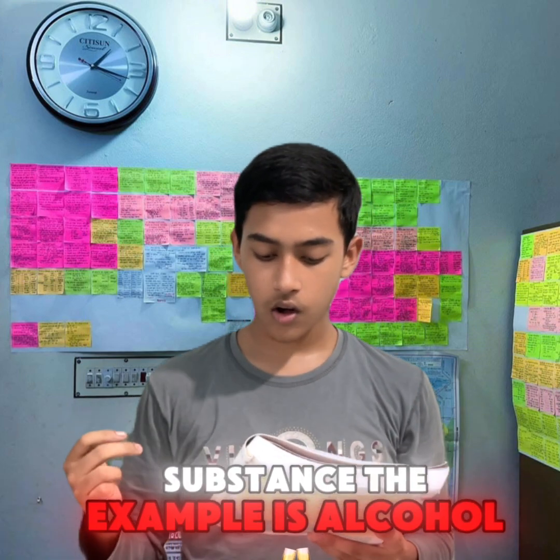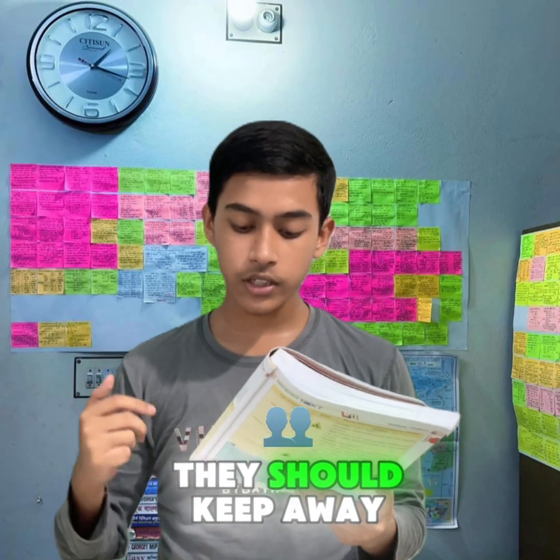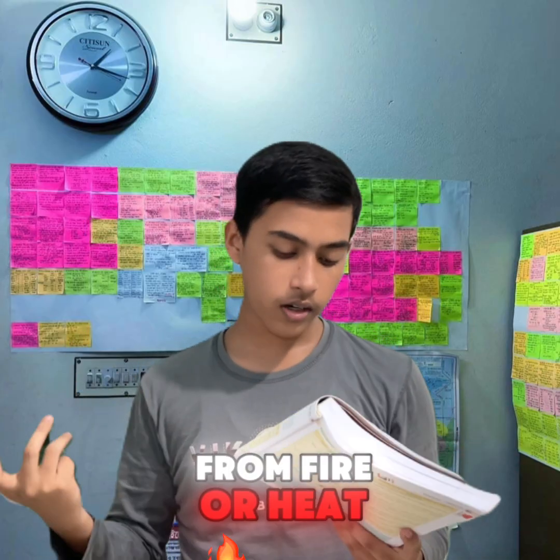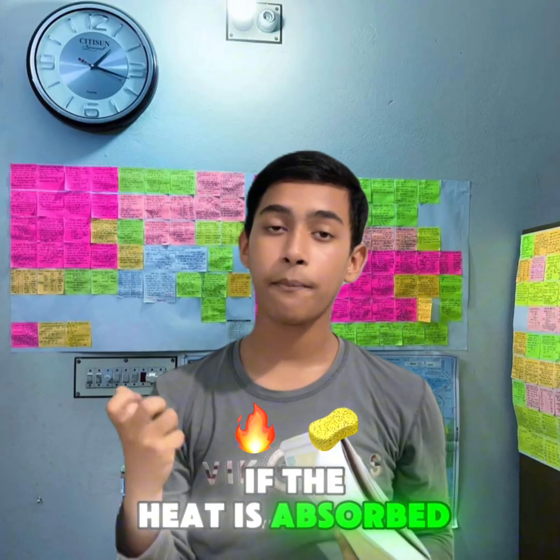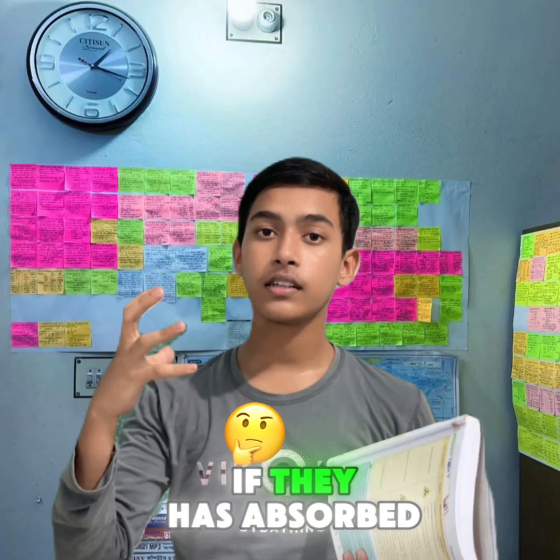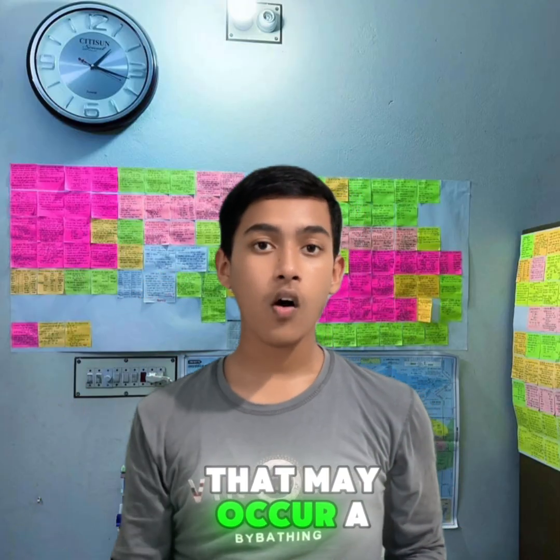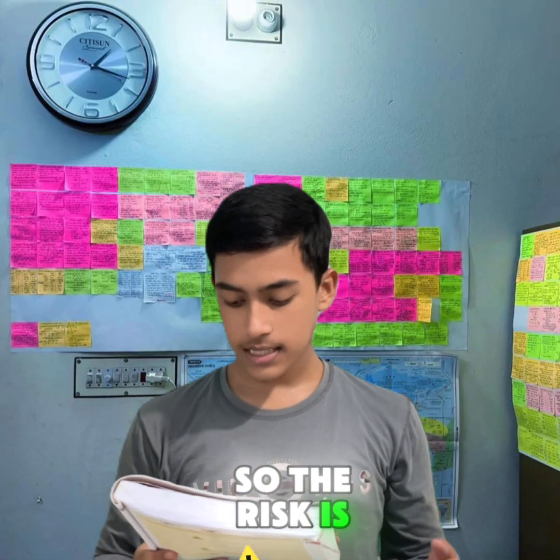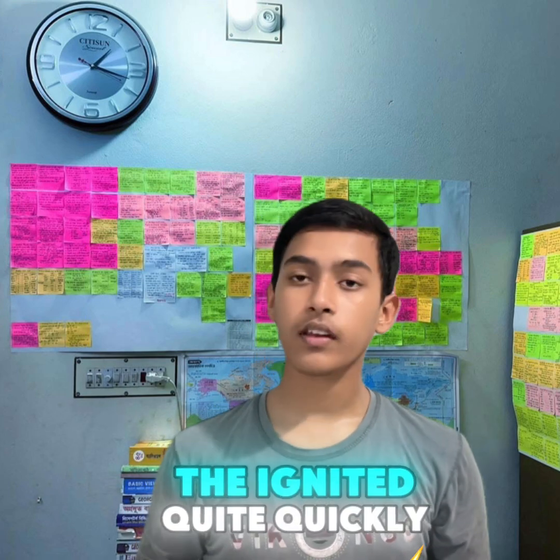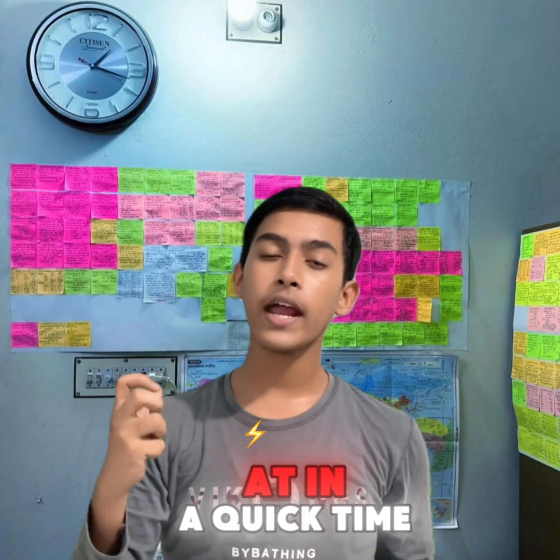Then there are flammable substances. Examples are alcohol, ether, etc. Flammable substances should be kept away from fire or heat, because if they absorb a huge quantity of heat, they may catch fire and turn into a big fire. So the risk is that these materials ignite quite quickly. If a fire starts, we must control it in a quick time.